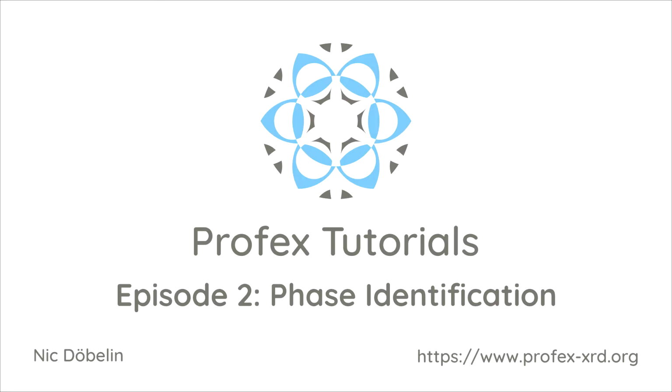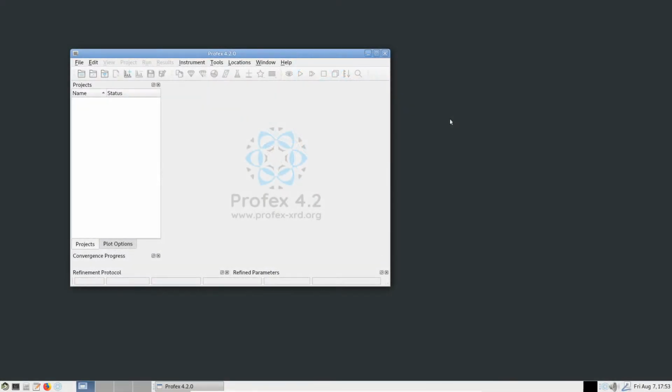In this episode I'm going to give a brief overview of the user interface of Profex, and then we are going to process a dataset and try to identify the phases in the sample. This is what the Profex main window looks like right after installation and setup. But before we begin, we need to download a raw dataset from the Profex website.